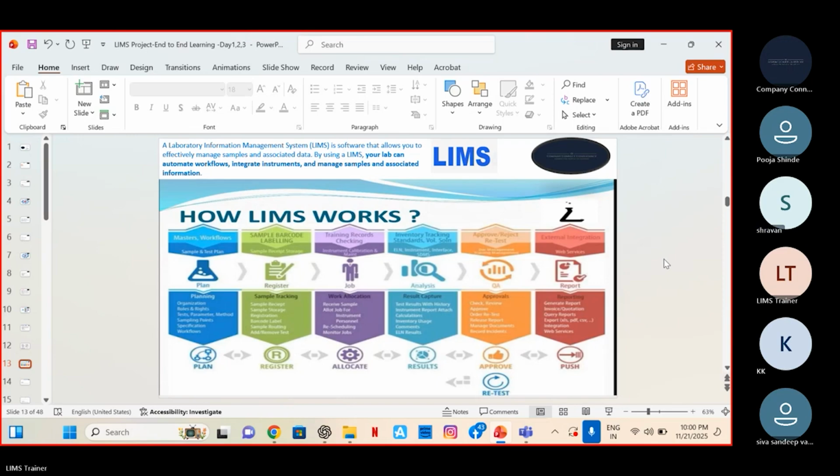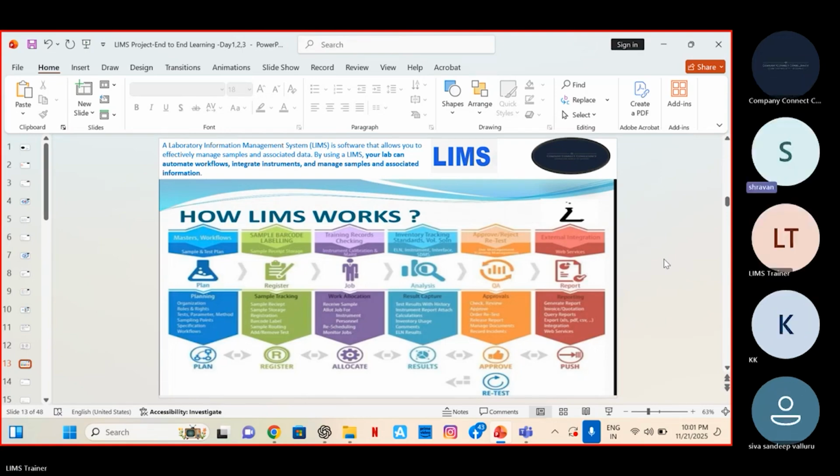No, that also depends. There will be another module for the microbiology. So that also requires the knowledge. If I work in a pharmaceutical laboratory, that doesn't mean that I can work in a microbiological laboratory as well. For the LIMS also, a separate candidate is needed, who has that microbiology understanding and can explain to the developer to develop the tool, and simultaneously do the testing master data creation also.